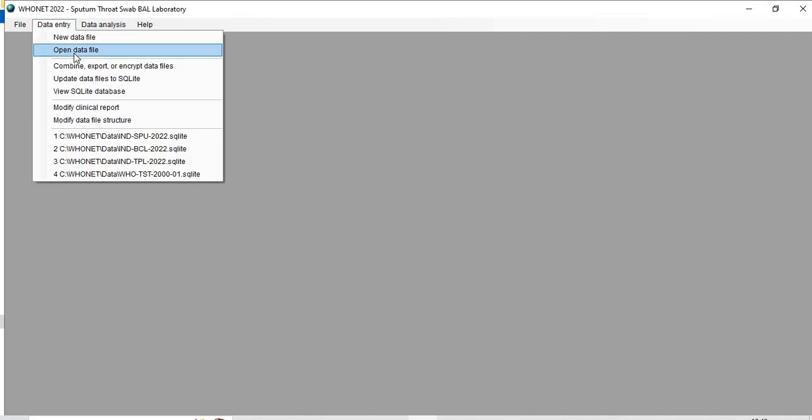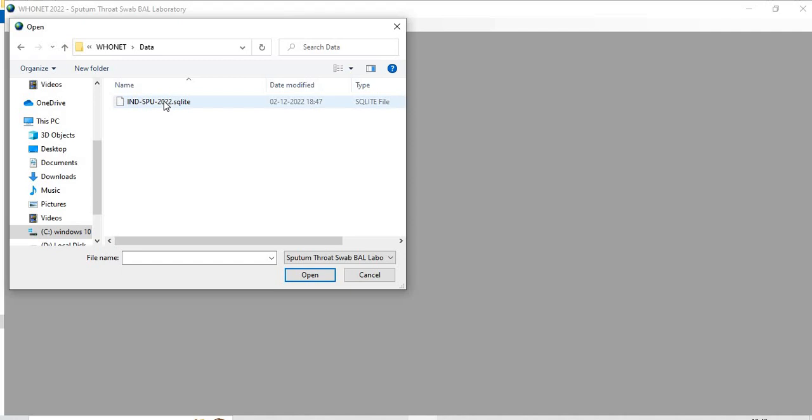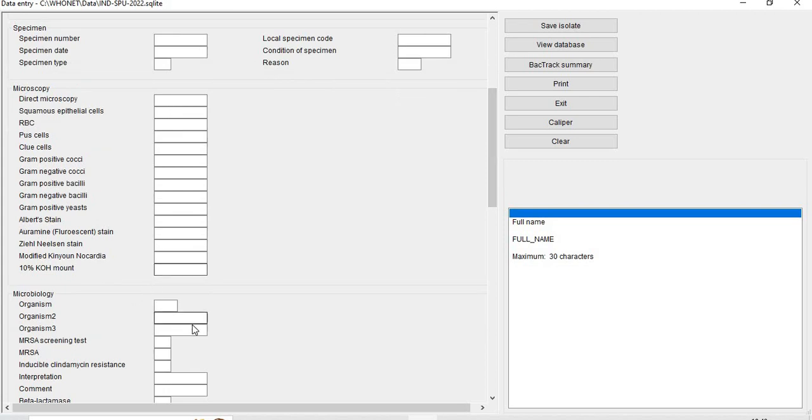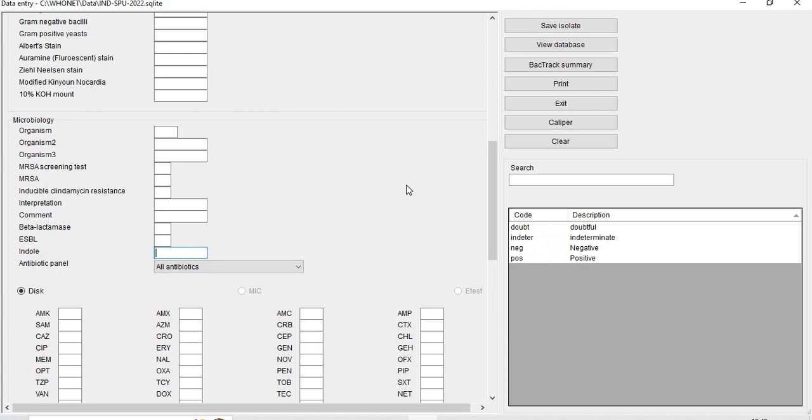Now if I open the data file, for indole you can see it now has the code and the description. I hope this video is useful for you. Thank you.